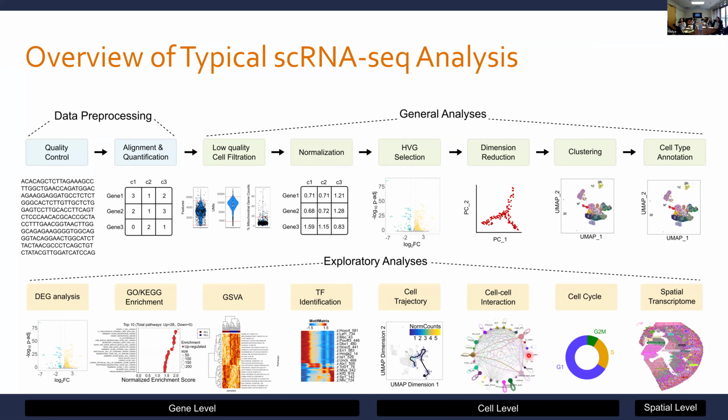You can see how different cells interact with other cell populations. So each one of these circles is a different population of cells in a data set. And the lines are basically showing the number or strength of interactions between those cell groups. You can just catalog which cell cycle genes are active, and you can categorize your cells based on where they are in the cell cycle.